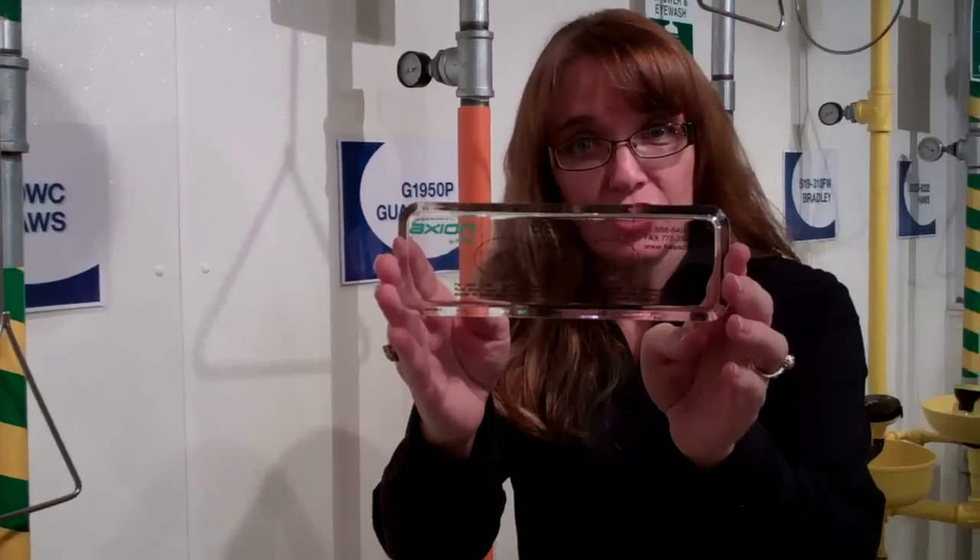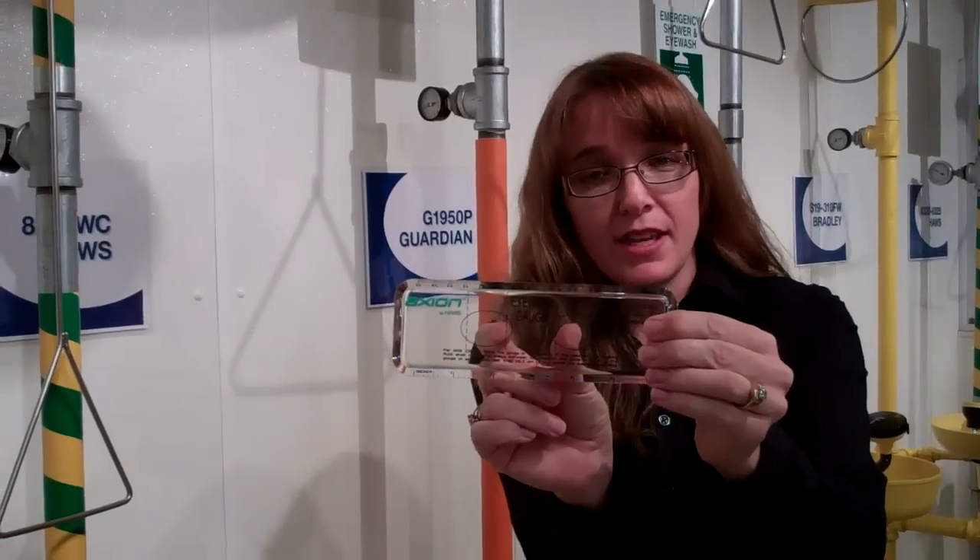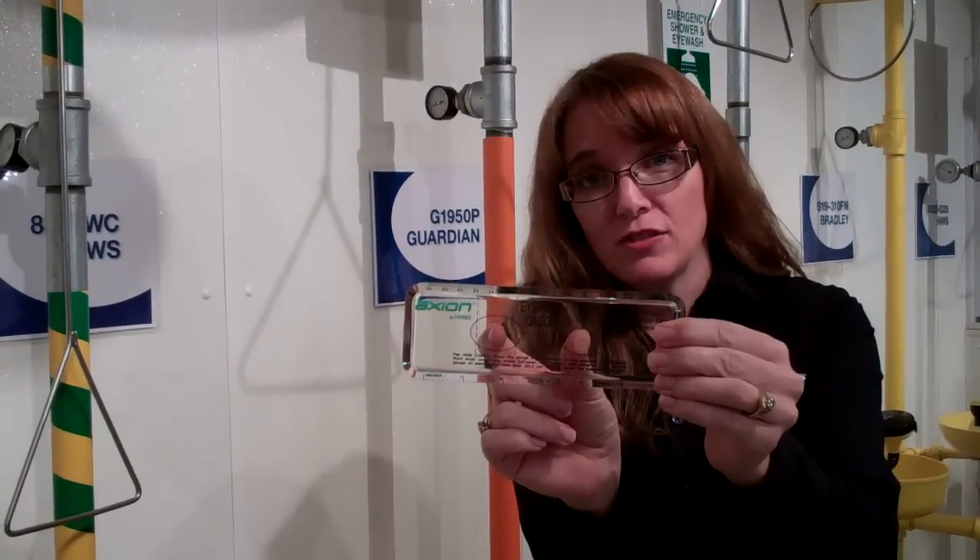Hi, I'm Margo Mee and I'm the Product Manager at Haws Corporation. Today we're going to teach you how to use an eyewash gauge to test an eyewash. ANSI Standard says that you should use an official eyewash gauge and that when you are testing the flows, the two points of water should reach these two spots here no more than eight inches from the head. We're going to show you how that works.